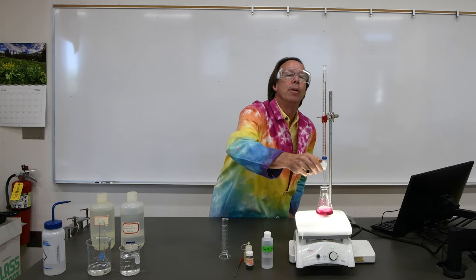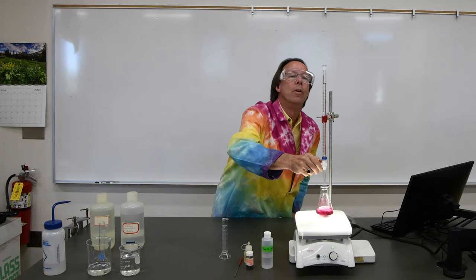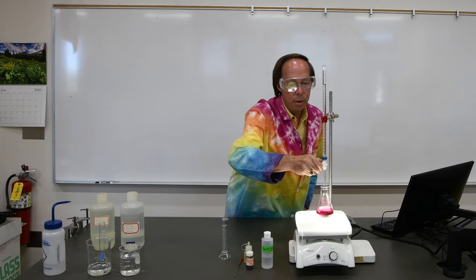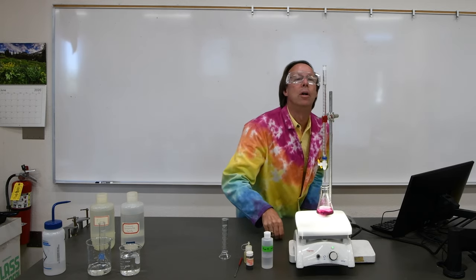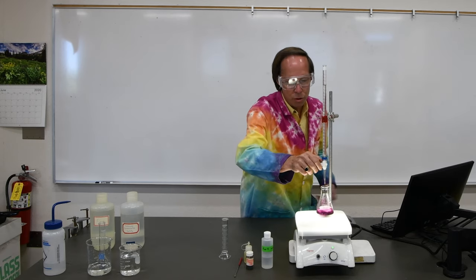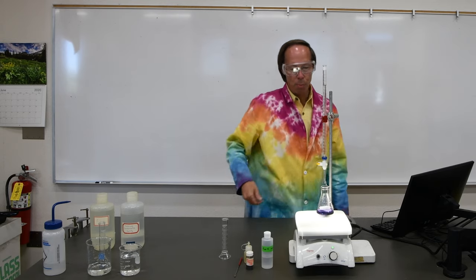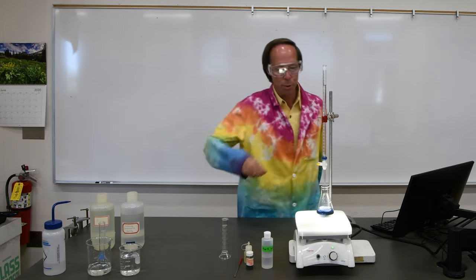And let's start adding. This time we'll do it still a little bit slower. Right, there's half a milliliter. There's 1 milliliter. Now I'm going to slow down the rate here. We'll let the drops go in more slowly and sneak up on it. We're at about 1.5 milliliters. It looks like it's getting close. There's our purple color. Let's see if that is just enough to turn it to blue.